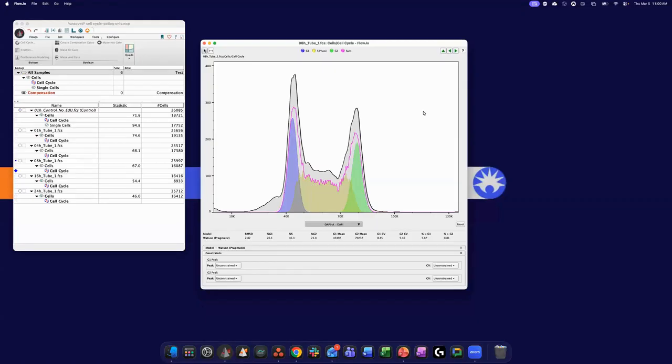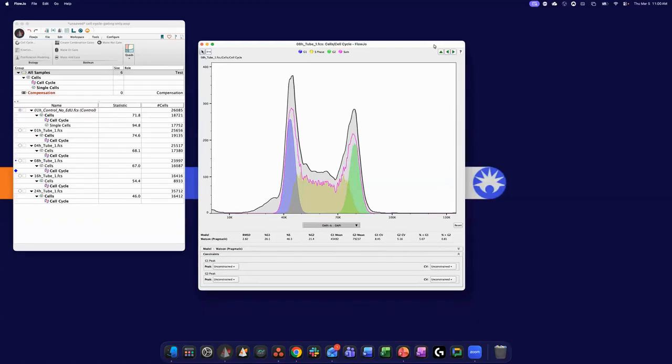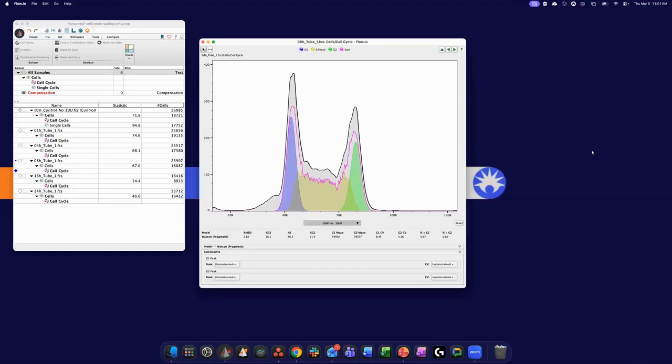Maybe my fixation is too long, or not long enough. Maybe I'm running it on a high flow rate. Because these are all going to impact the distribution of that dye. So I suppose it could be possible, but if I were reviewing a paper, I would need a justification on why I'm not seeing what's been established, and also be sure that my protocol is really optimized.